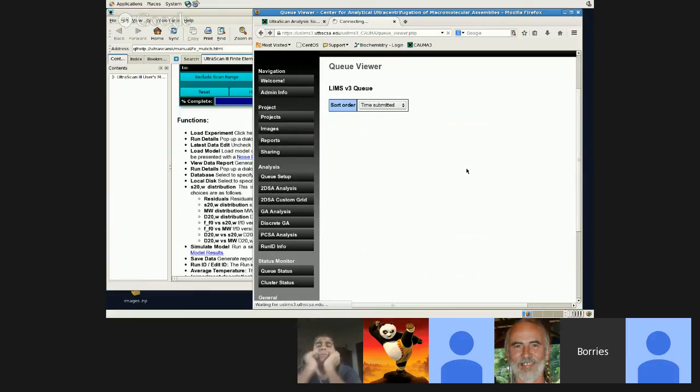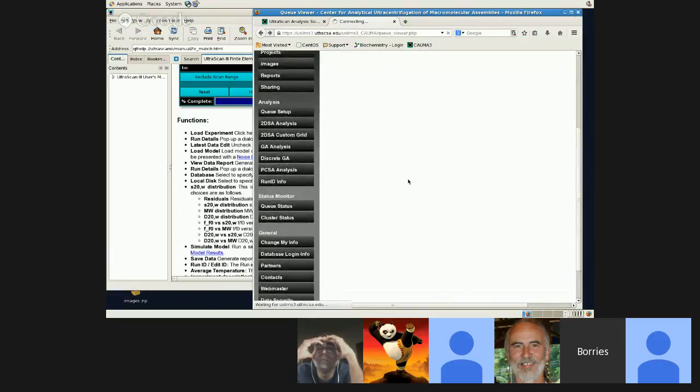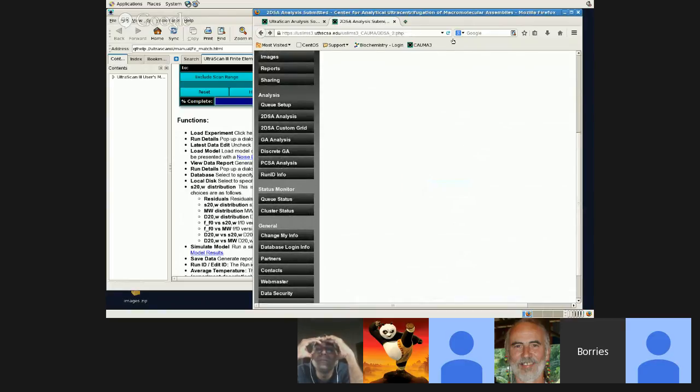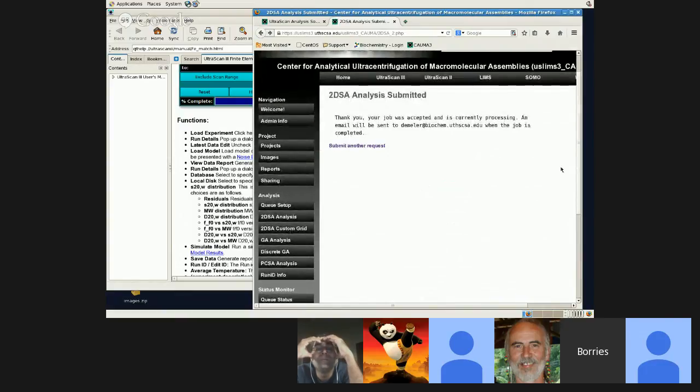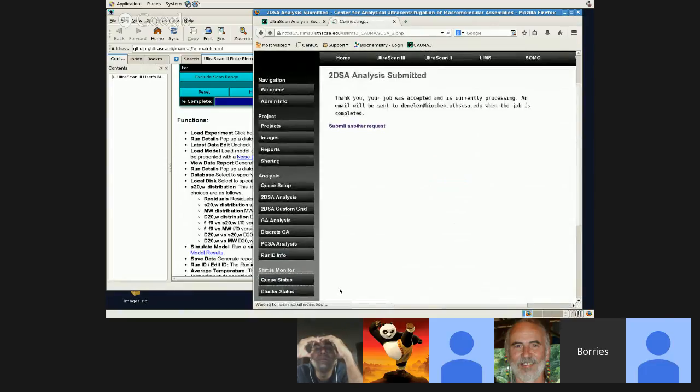Looks like a lot of jobs are in the queue right now, so it takes a while to load it up. It's the queue status.